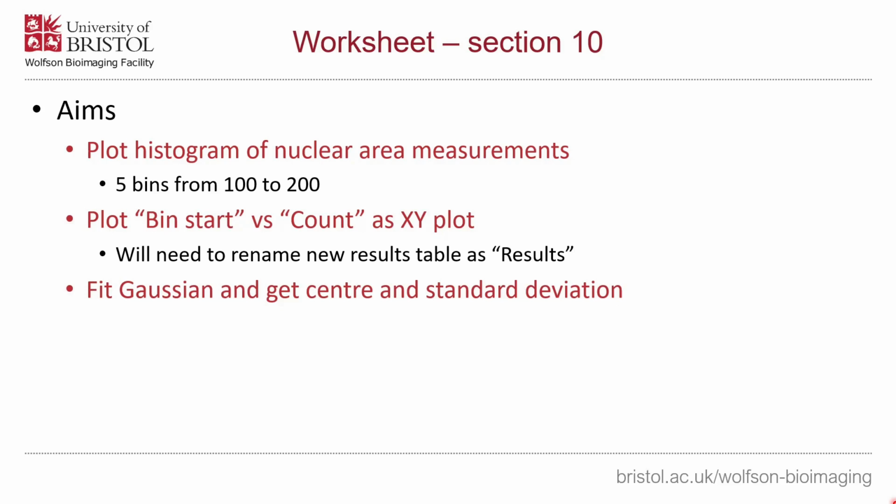In results, we'll then plot the points as 5 separate circles, or however you want to plot it. And then we can use the plot window's fit function to fit the Gaussian and extract out the center of that Gaussian and the standard deviation.